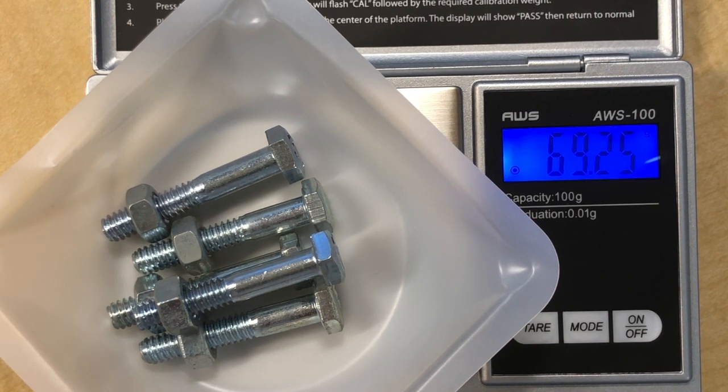This gives you the mass of 5 BN molecules. The scale reads 69.25 grams, and dividing by five means each BN molecule weighs 13.85 grams.